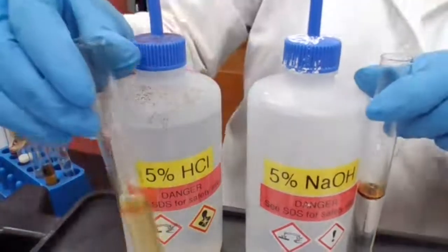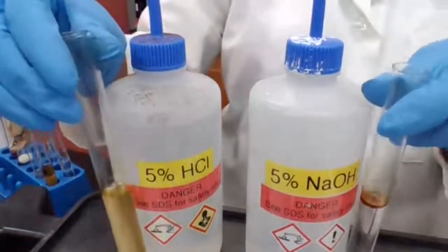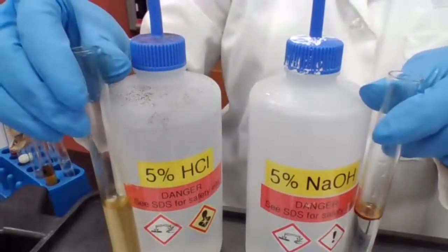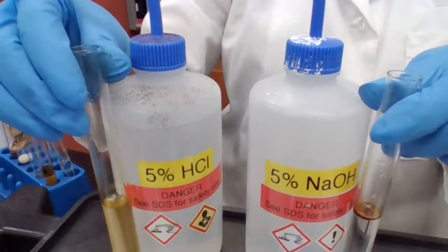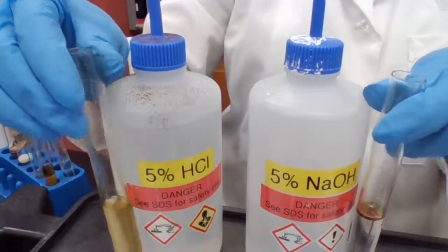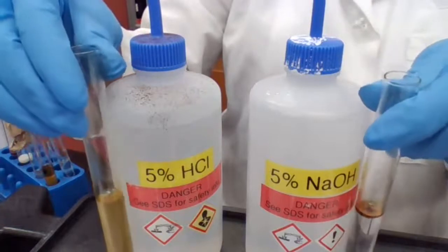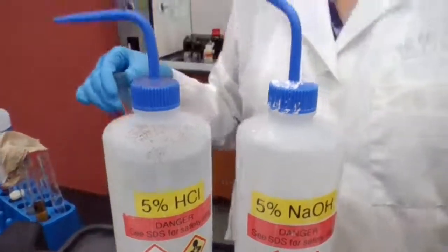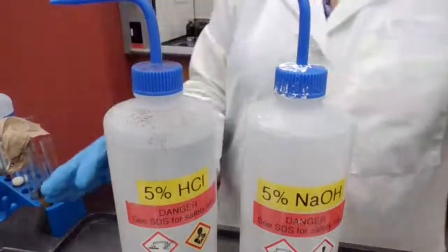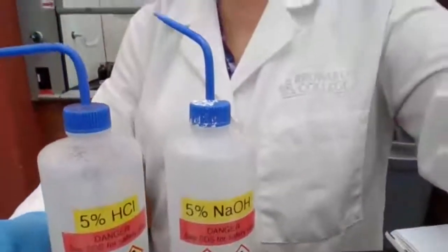In HCl, it dissolved. In sodium hydroxide, it did not dissolve. You got it? Yes? Okay. I think that's enough with the solubility, right?